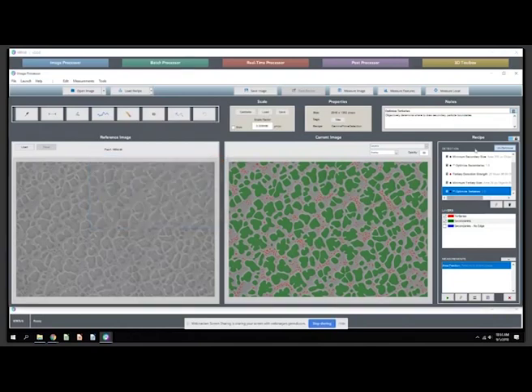So what you'll see here on the right now is our simple recipe mode. This is a rather advanced recipe, despite the short time it took to build. It is that lengthy because it had to address many of these image analysis challenges.